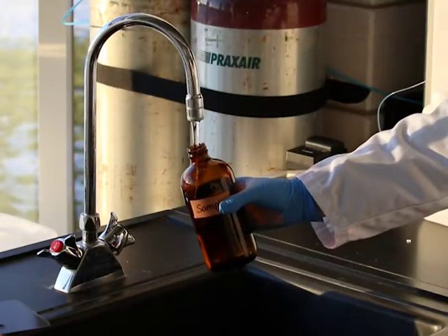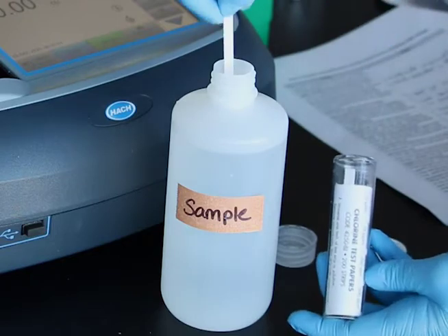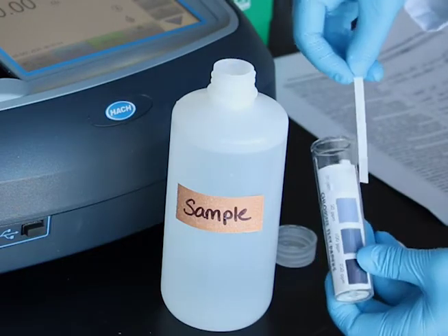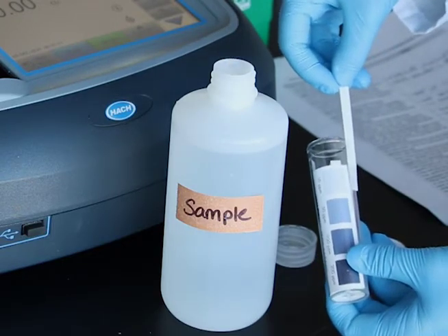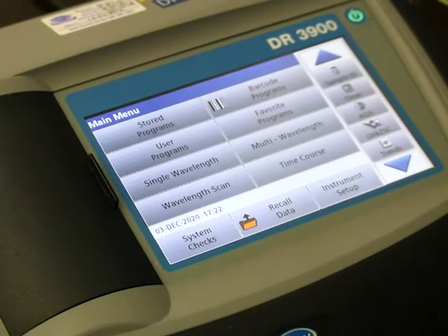Samples must be collected in clean glass or plastic bottles. Quench chlorine if any remains in the sample by following the directions in your procedure. We will be using the HACH DR3900 spectrophotometer for our demonstration.